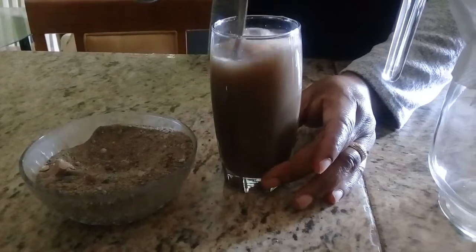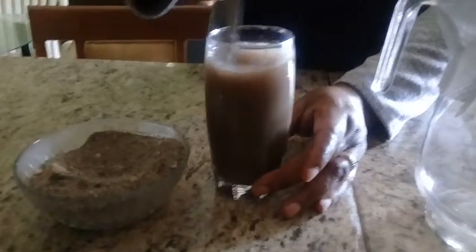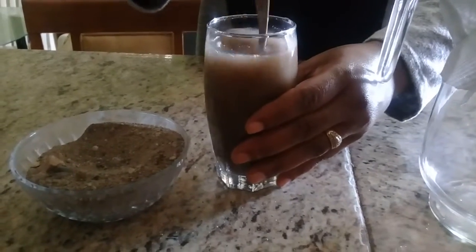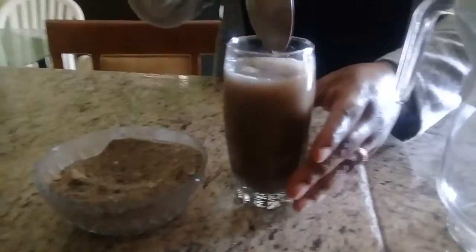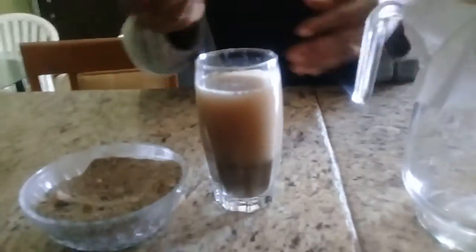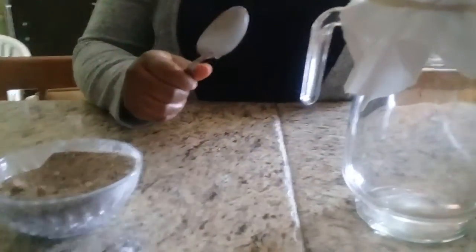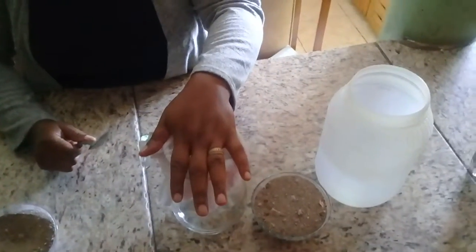Now, when we talk about decanting, when we mix a liquid with an insoluble solid, what we do is leave it for a while unmolested. That simply means we will just put it in an area where no one troubles it. So I'm going to put it over on this side in this area and leave it for a while. Now the next method I am going to demonstrate to you is filtration.